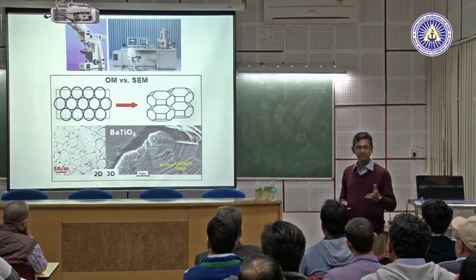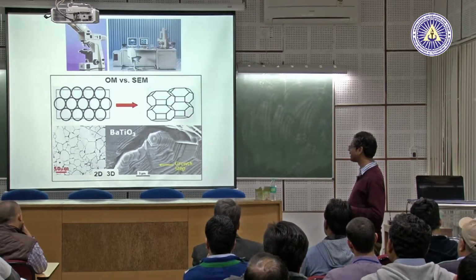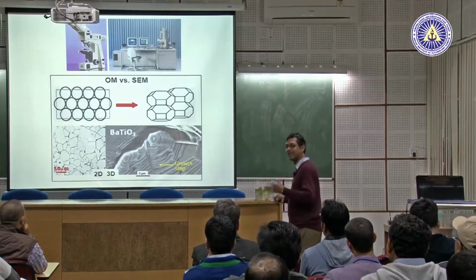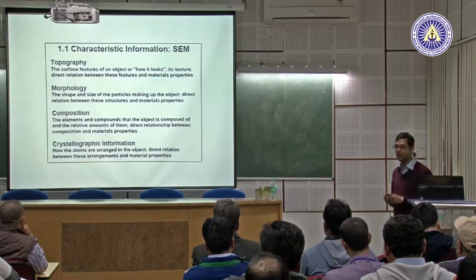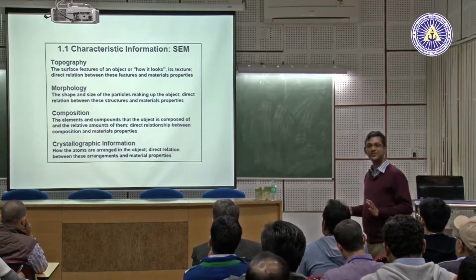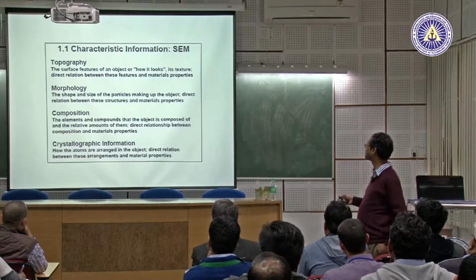So sometime, although this is not true here, sometimes people say in an optical microscope you get a two-dimensional image, in SEM you can get a 3D image. You don't get a 3D image at all, but you can generate the 3D image using these 2D sections. This is one biggest advantage. Okay, so what all you do in a nutshell in SEM? You do all this stuff nowadays, but these are not all. Many things else you can do also.